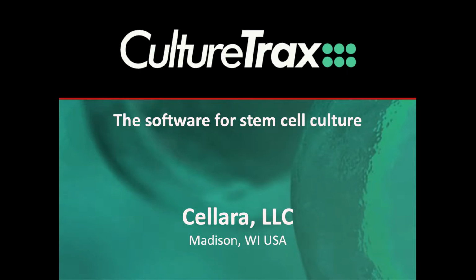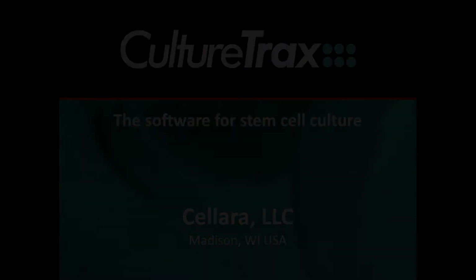This video explains why we developed CultureTrax and then gives you a brief tour of the platform. It's about 20 minutes long. If you would like to skip directly to the software demonstration section, that starts at the 6-minute 45-second mark.